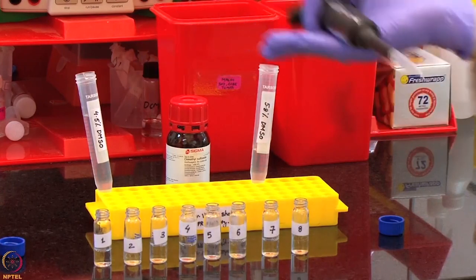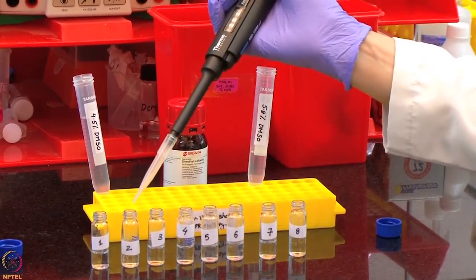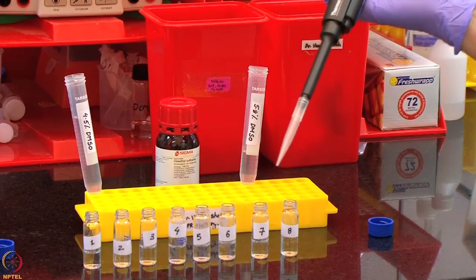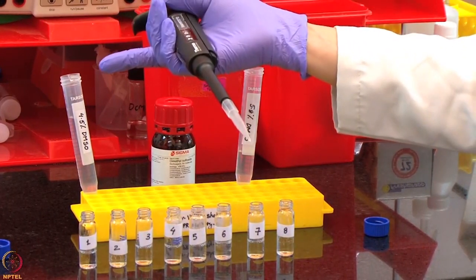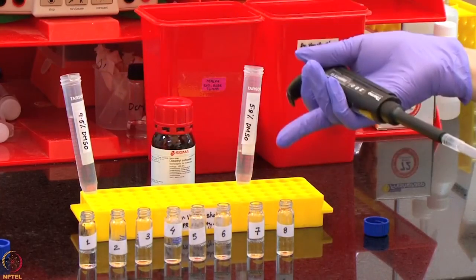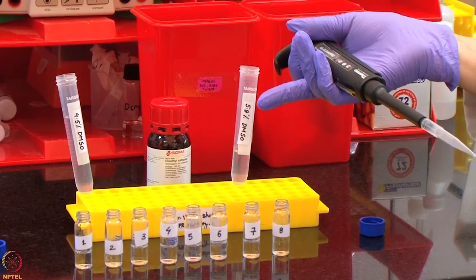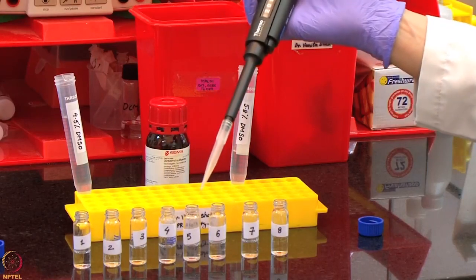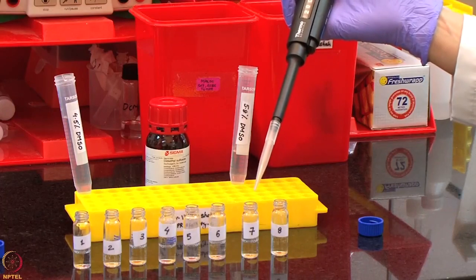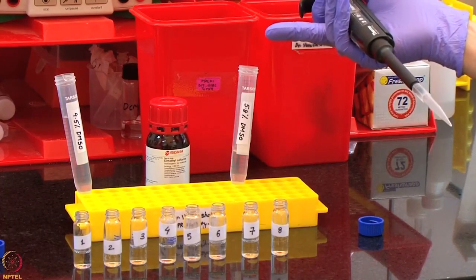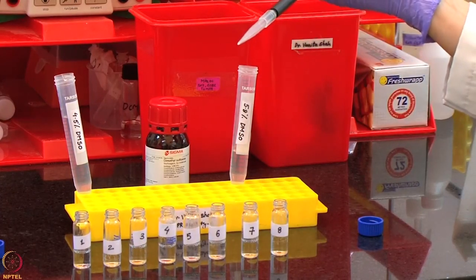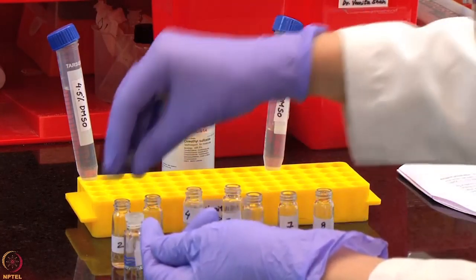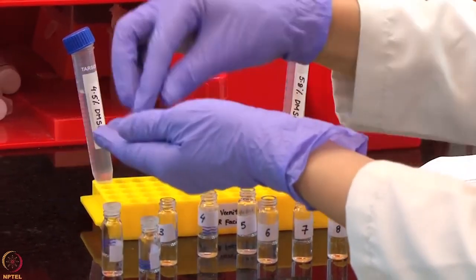we have numbered the tubes as 1 to 8 and added 200, 400, 600, 800, 1000, 1200 and 1400 microlitre of 4.5% DMSO in tubes 2 to 8 respectively. Following this, we added 1400, 1200, 1000, 800, 600, 400 and 200 microlitre of 5.8% DMSO in tubes 1 to 7 respectively. We will mix these solutions vigorously and put the lids on and keep them in dark till we are ready with all the other samples.